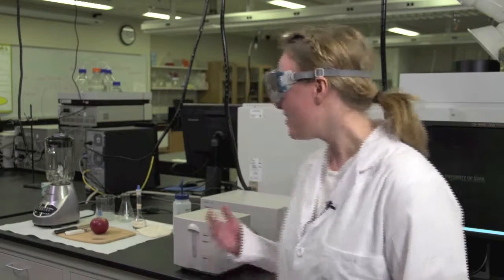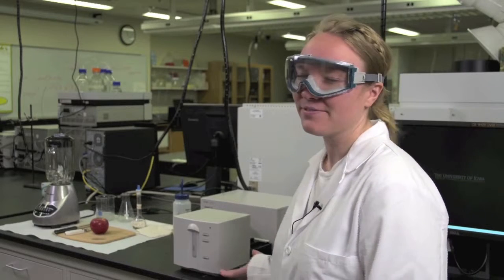In this lab, you'll be studying the reaction that occurs during the browning of fruits and vegetables. This is the reaction between catechol and molecular oxygen to form water and 1,2-benzoquinone. Benzoquinone shows up in the visible spectrum, so we'll be using the UV visible spectrometer to monitor this reaction.